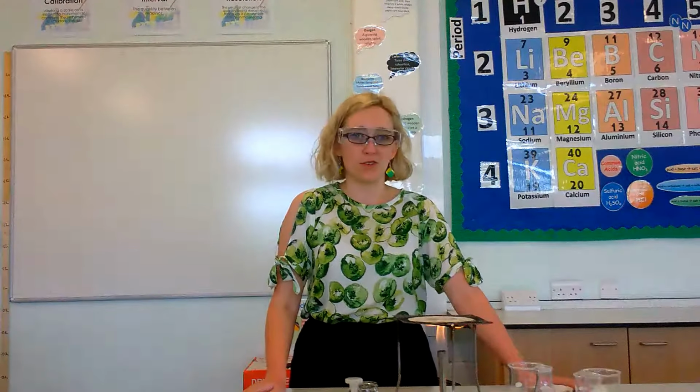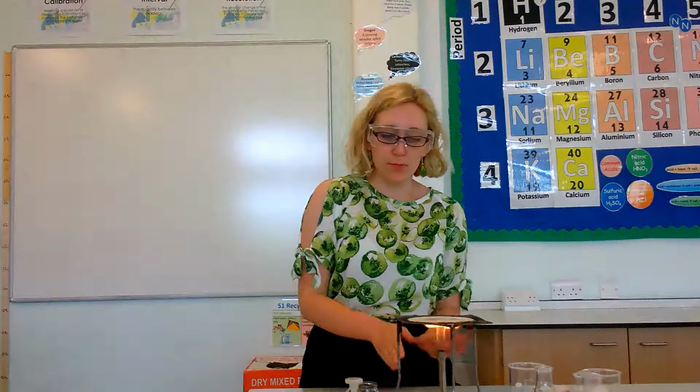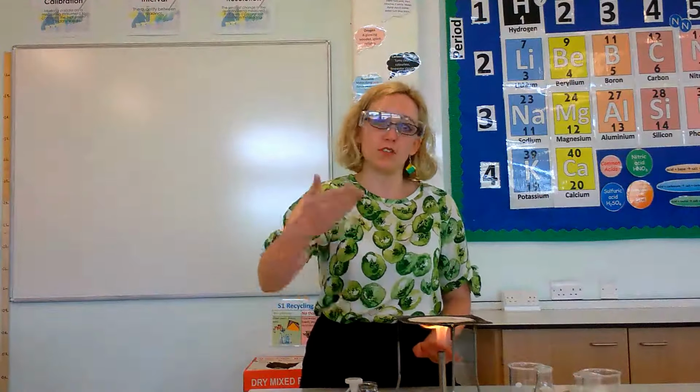Going to be completing the practical called making salts. So for this practical, what you will need is a Bunsen burner, a heat-proof mat, a tripod and a gauze, which I've already got set up here.